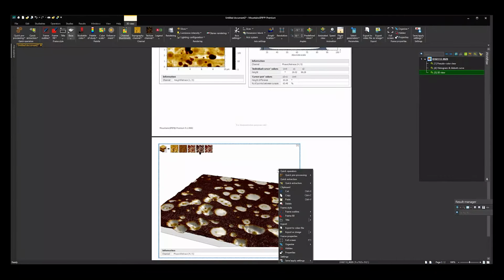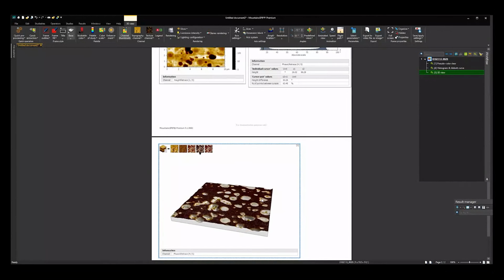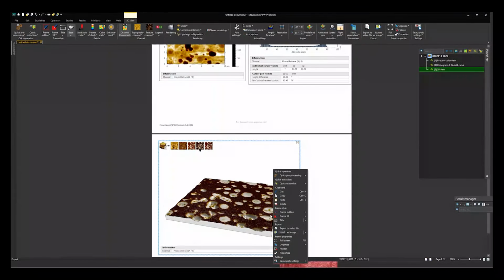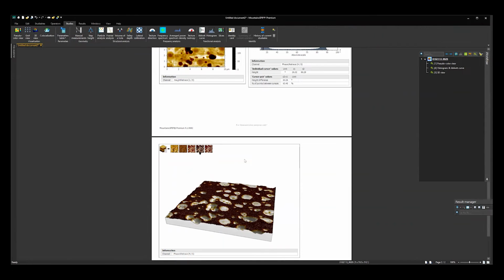And as usual, you can right click and get a lot of different options in terms of whether you want to export the image, and other various properties of it. You've also got a lot of the options up here, in terms of you can amplify. I was doing that manually with the scrolling. We can add in axes. So full customization as usual. But the 3D with the overlay of one channel onto the other is really useful.